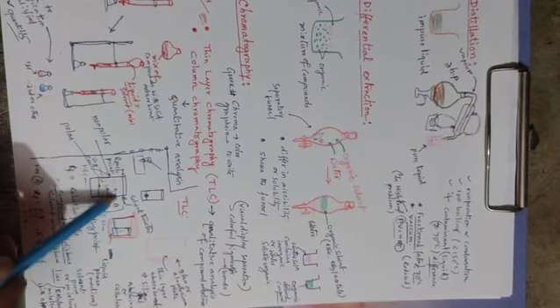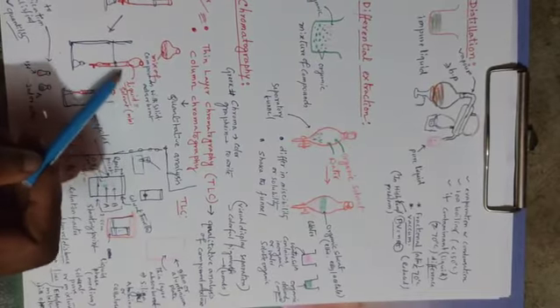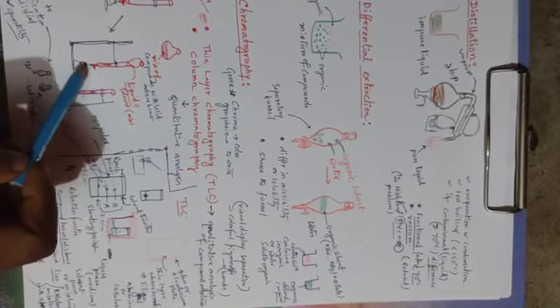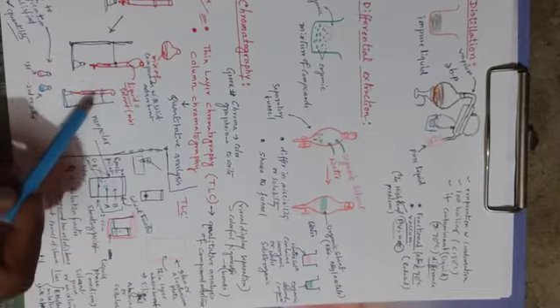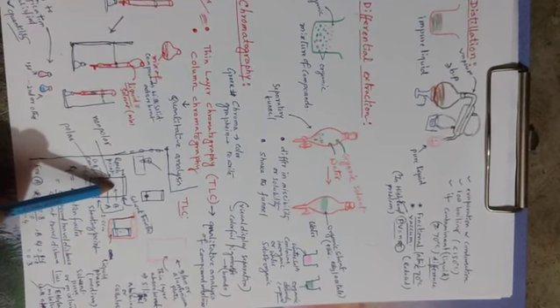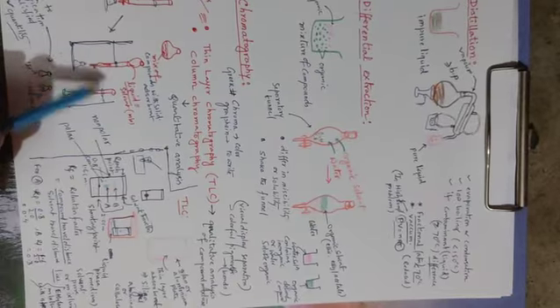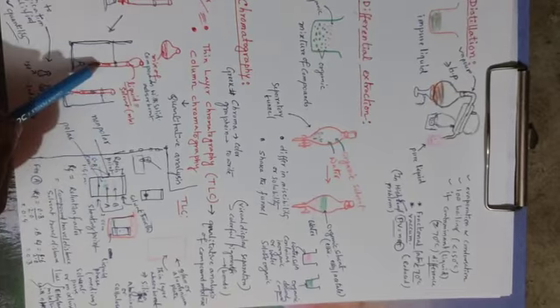When the mobile phase comes down, it also makes our mixture of compounds soluble, and it comes down due to gravity, or with pressure from above. Then the non-polar compound will come out of the column first, because it has less binding affinity towards our stationary phase, and compound A, which is polar, has more binding affinity towards our stationary phase.